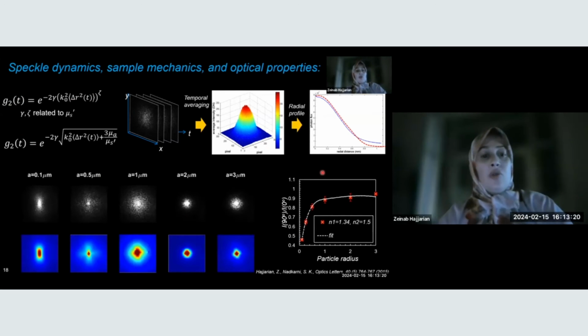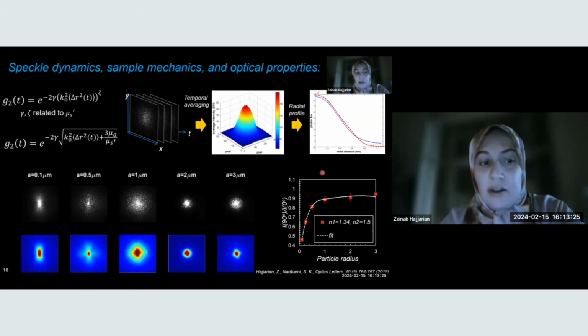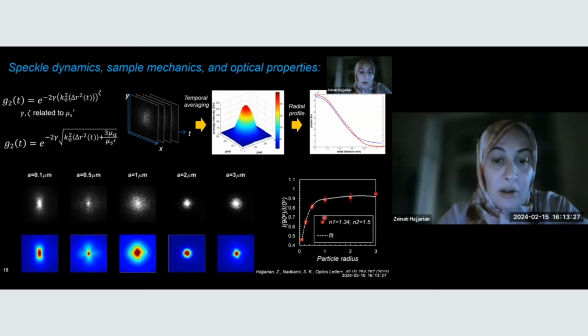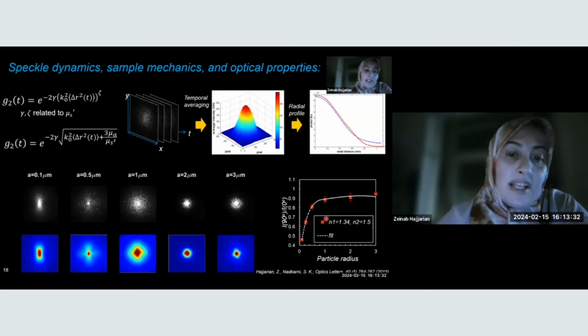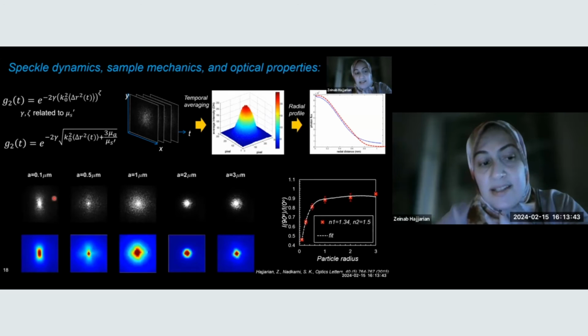When it comes to measuring, you remember we had another factor, the size of the light scattering particles. So that also needed to be estimated. The other observation that we made was that if we look into the polarization attributes of laser speckle, the information about the particle size is encoded there. So, for example, if we look at the copolarized component of the speckle, basically we illuminate the sample with polarized laser light and then look into the component of the light that retains the initial polarization state.